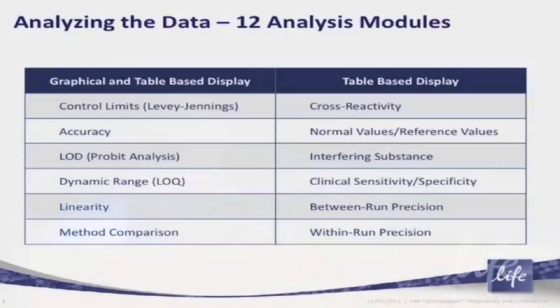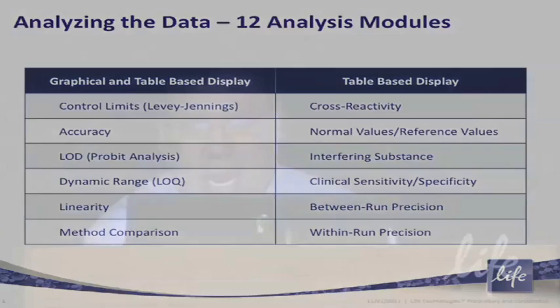This was a 9-page protocol because there are plate layouts for each day as well as dilution schemes. This is what you would see on the web. Basically, you can select certain areas and go to acceptance criteria, input reagent lots, and also enter your results. You also get a plate layout, and this plate layout can be changed and modified. It's JavaScript, so you can drag and drop anywhere on your plate layout to change it to meet your needs. And finally, there is a signature page at the end of the protocol.